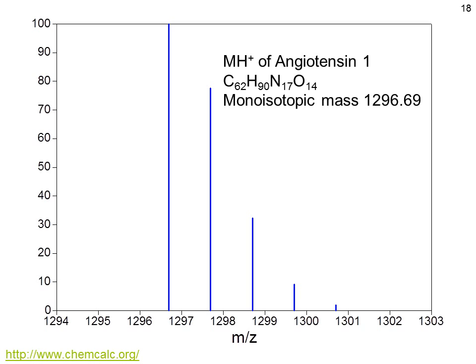Yes, they are also present, but they are not visible in this mass spectrum. You would have to zoom into the background noise, because remember, carbon-13 is 1.1%, while hydrogen, or deuterium I should say, is only 0.02%. You will see this fine structure with very high resolution mass analyzers if you zoom into the baseline, but for most practical purposes of bioanalysis we are only concerned with the carbon-13 isotope pattern.